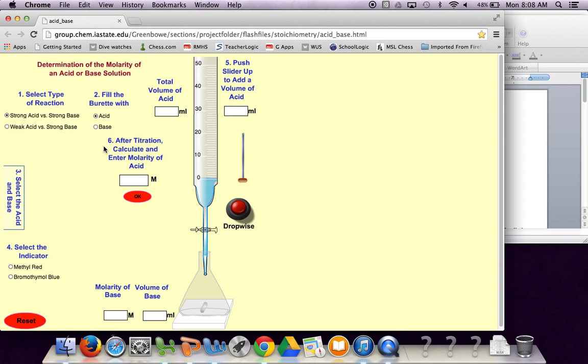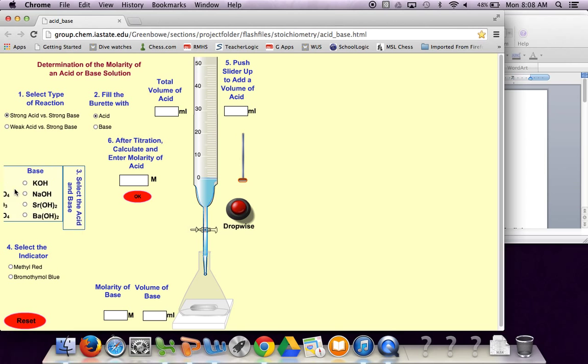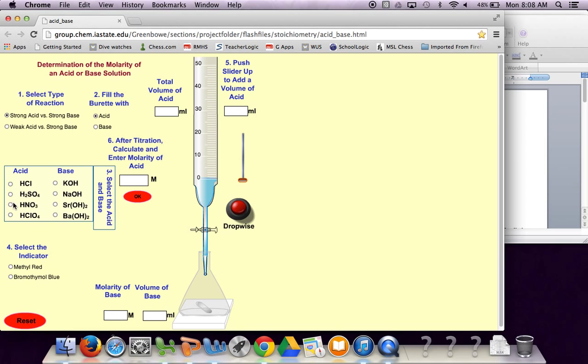You can put base in your burette but bases tend to eat glass so we don't like to do that. We're going to select the acid and the base. Let's click on maybe HNO3 nitric acid and some potassium hydroxide.